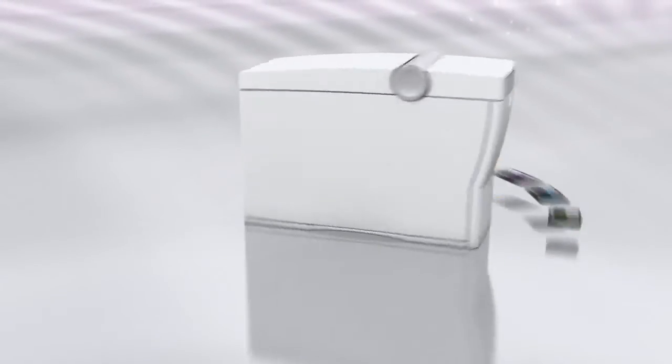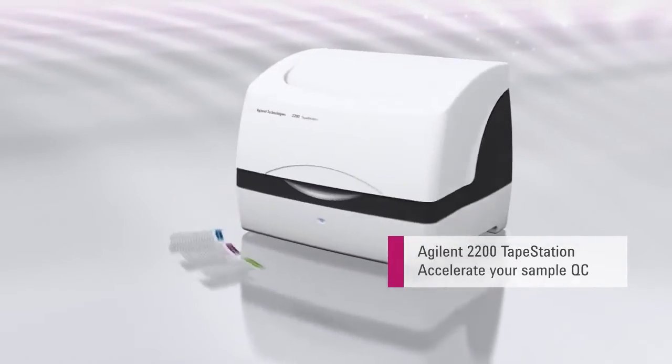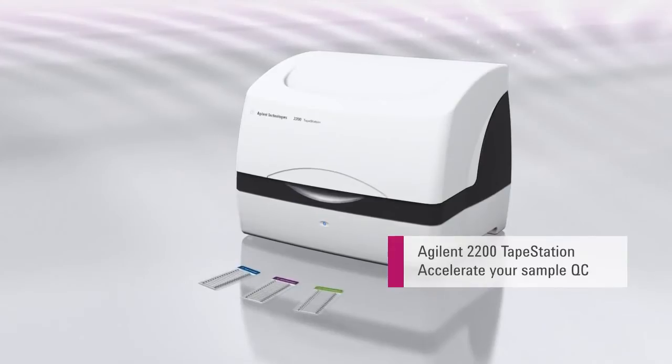Now, the new Agilent 2200 tape station with Agilent Screen Tape can help you accelerate your sample QC workflow with confidence.